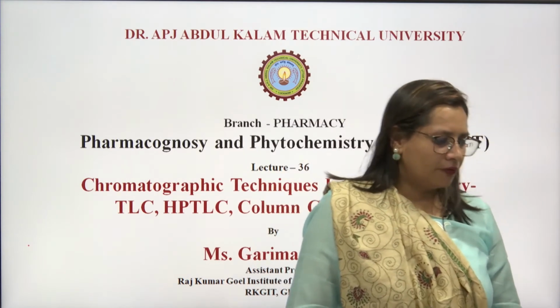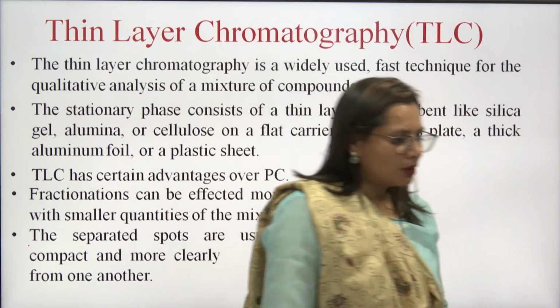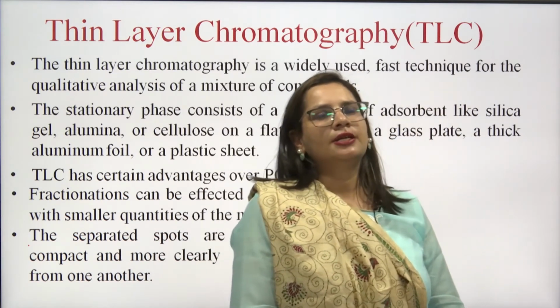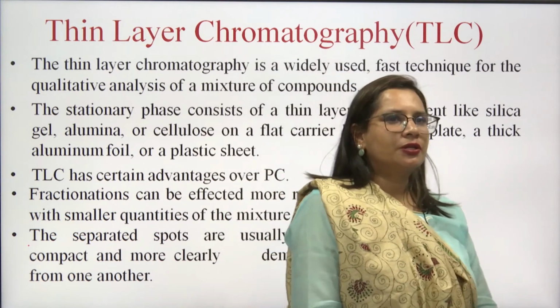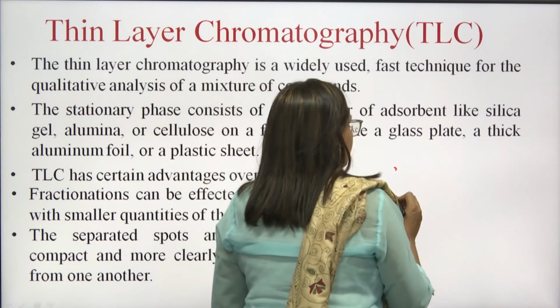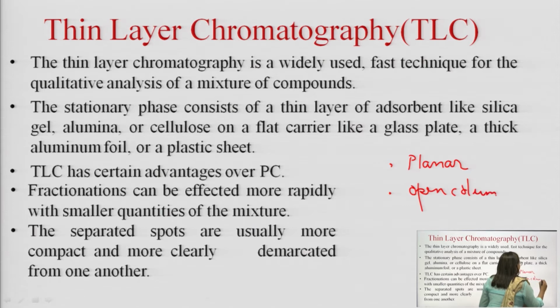We shall be discussing the topic chromatographic techniques in phytochemistry with HPTLC, TLC, and column chromatography. Under this technique, the first choice of discussion is the thin layer chromatography or TLC. As already mentioned in the earlier lectures, chromatographic separations can be divided as planar as well as non-planar or open column technique.